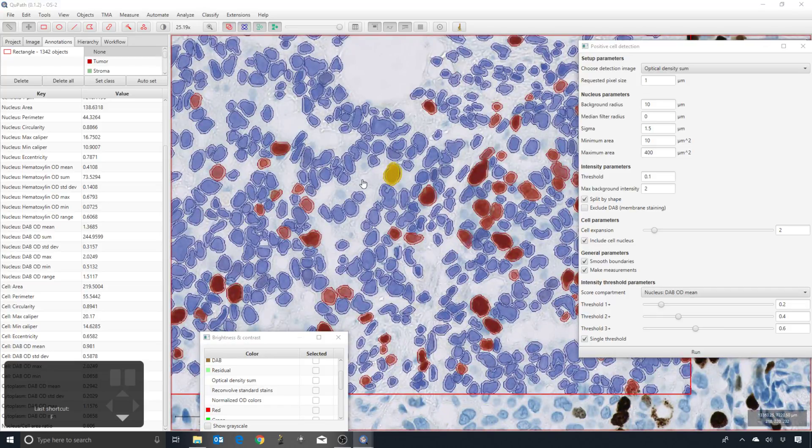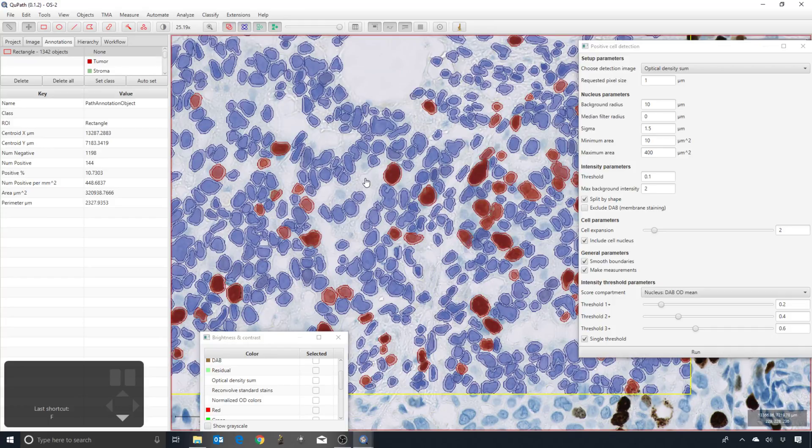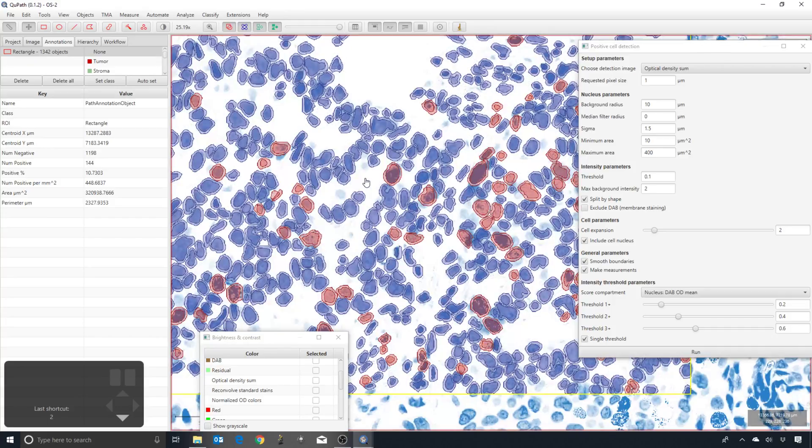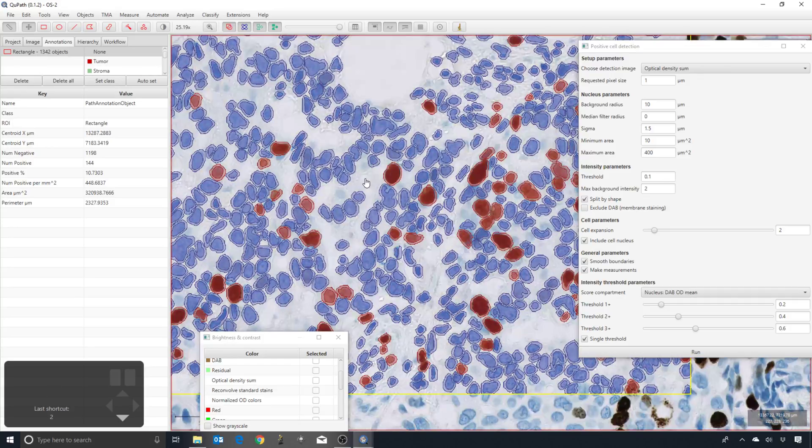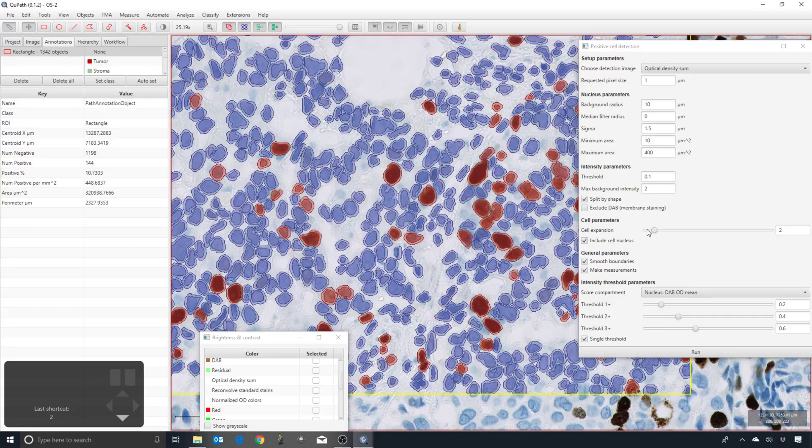You can adjust the cell expansion, and one of the reasons is not necessarily to give you a more plausible cell boundary, but more to get the measurements that are going to be most meaningful for you. It might be better to restrict them.